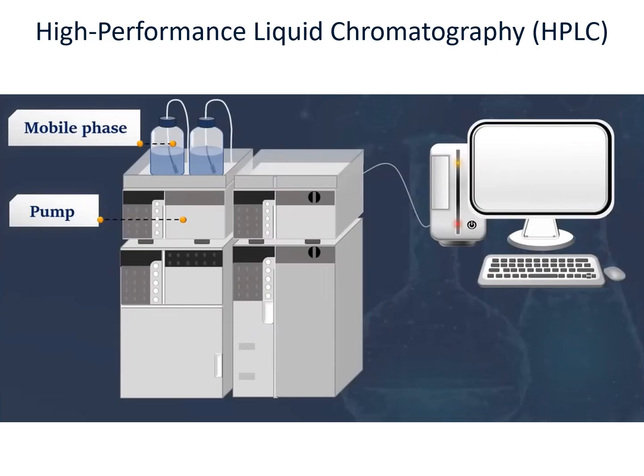So it works by passing the liquid sample under high pressure through a column that is packed with a stationary phase in which different components interact, leading to separation.